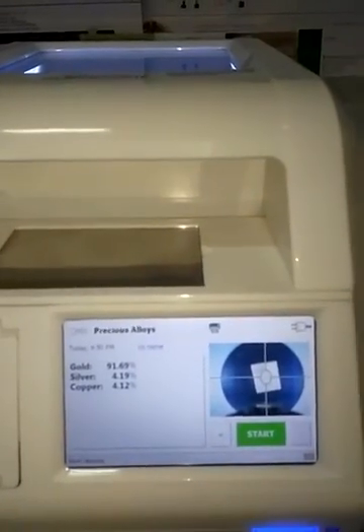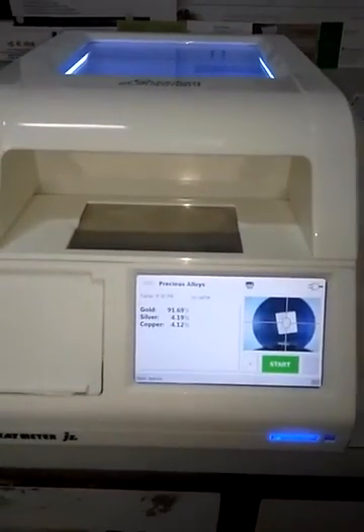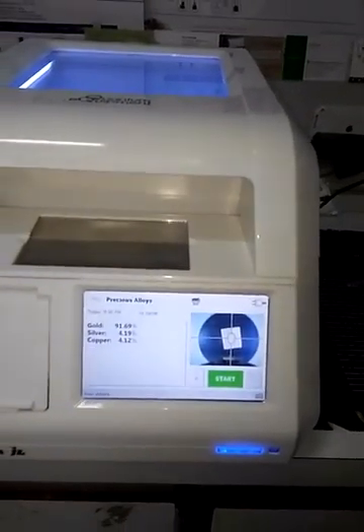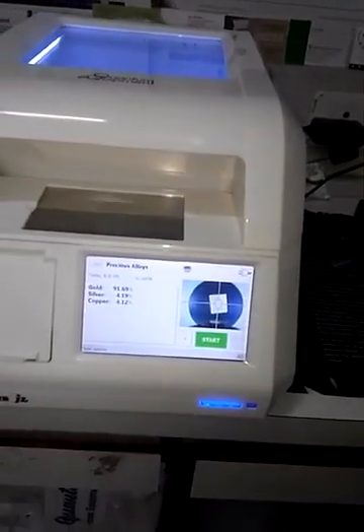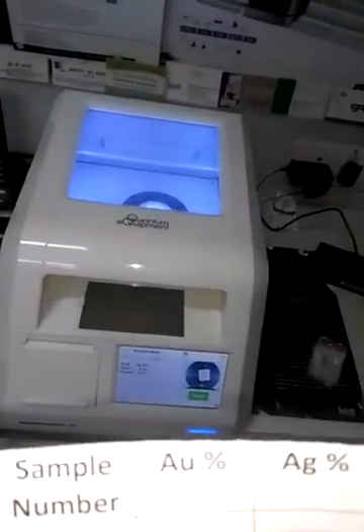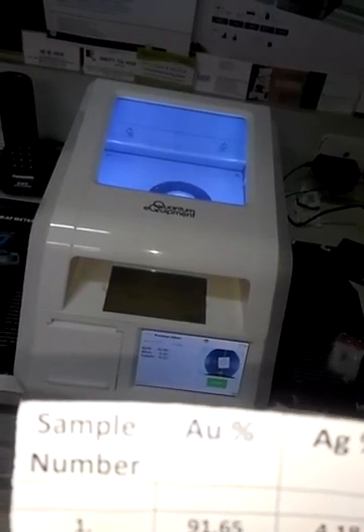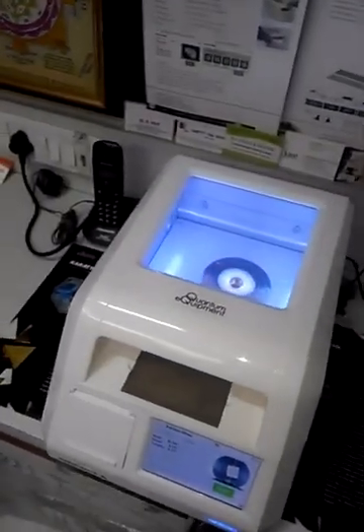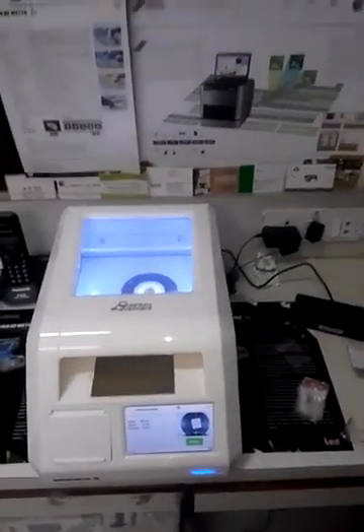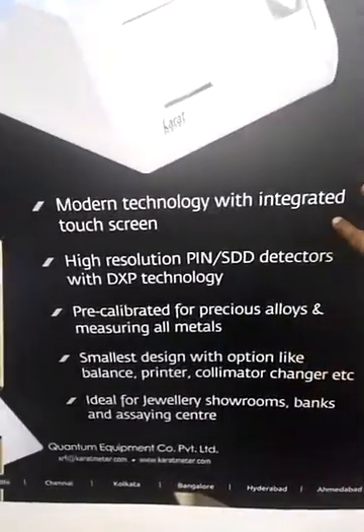The result is 916.9, and this was the result you can see. On my chip, the result for sample number one was 916.5. So I can say it's very accurate. This is the demonstration of the Caratmeter JL.